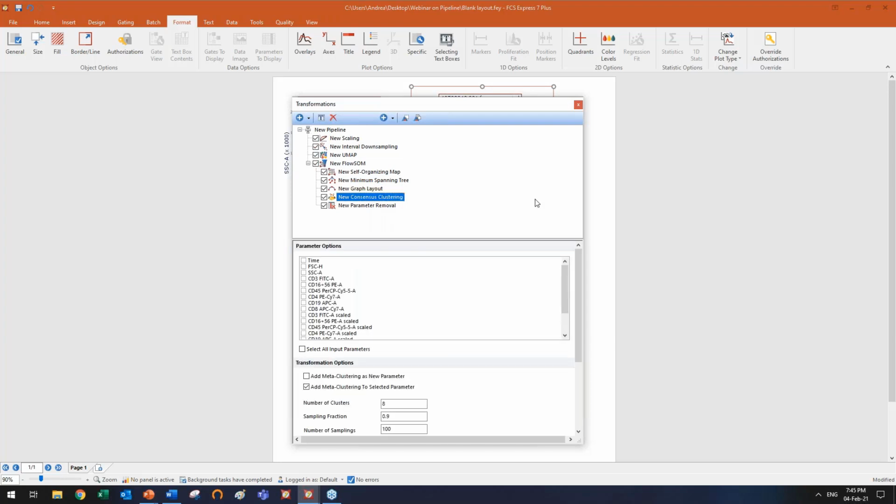Then you have the consensus clustering. This is also using the SOM cluster as an input parameter. The consensus clustering is a step that allows you to cluster clusters. While the self-organizing map that you see at the top of FlowSOM is clustering events, the consensus clustering is clustering clusters. Okay, it's really great. This is depicted in the FlowSOM tree as a halo around the nodes. We will see this in a few minutes.